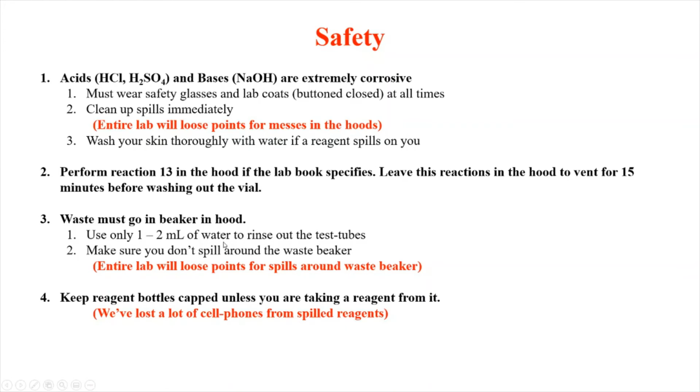And then we have to get rid of waste safely. So we place all of our waste in a waste beaker, which the lab techs will take care of. And then you just want to use the minimal amount of water to wash. And it's always important to keep the reagent bottles capped. This has led to a lot of lost cell phones over the years. So make sure that when you're doing these types of reactions, you keep your cell phone off the bench.